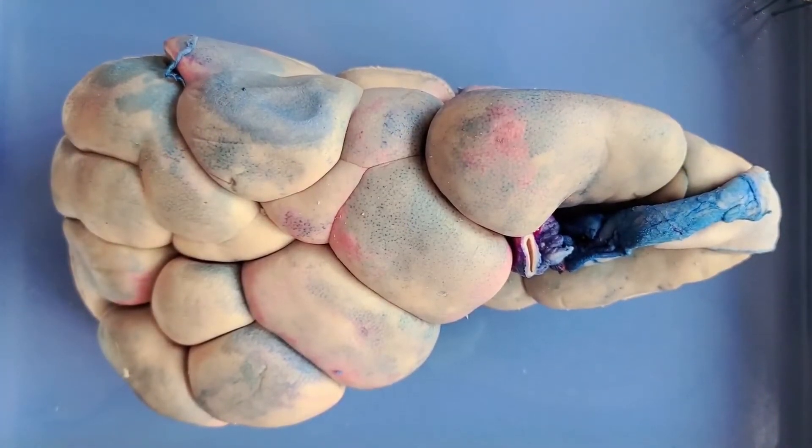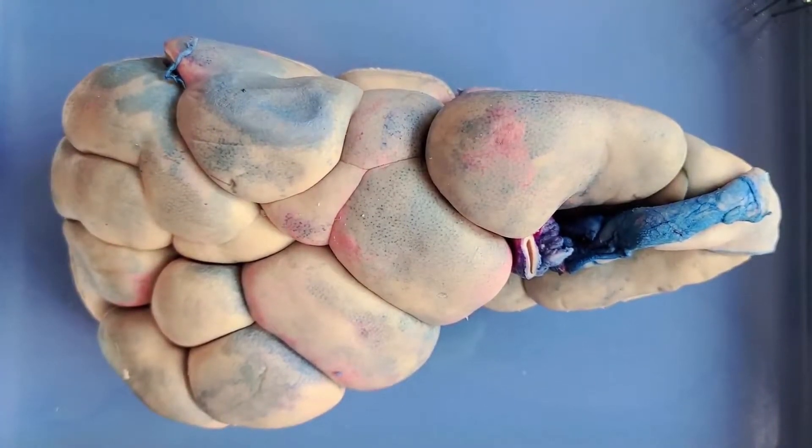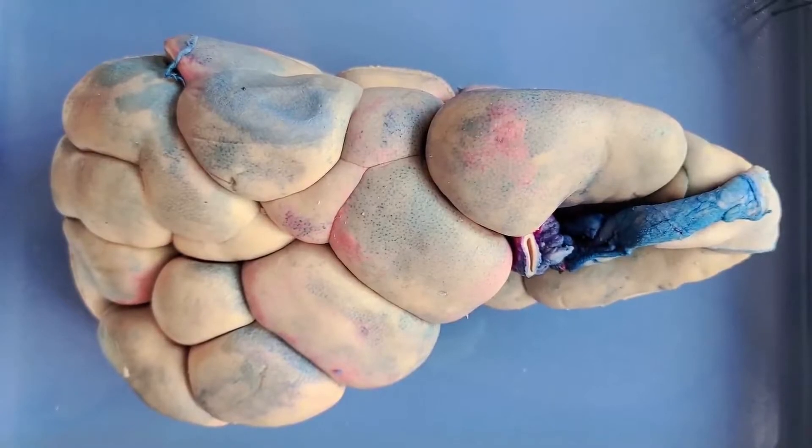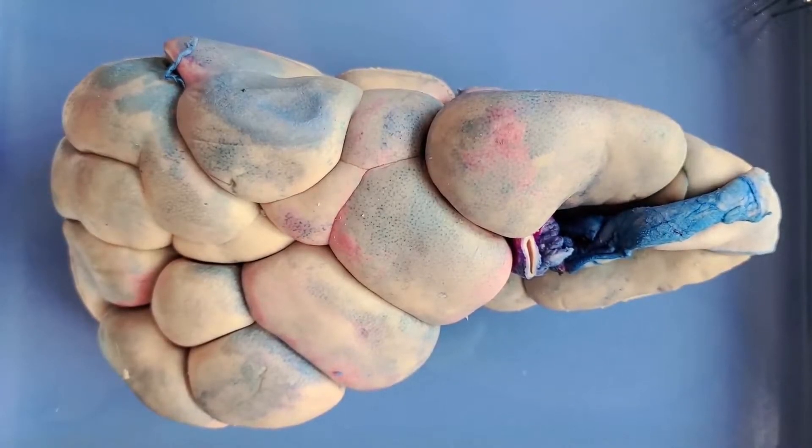Hello and welcome to O-Wyrm. Today we'll be taking a look at the anatomy of the kidney. This is a cow kidney. It's not exactly the same as human kidneys, but it's very similar and a good specimen for us to learn about mammalian kidneys.